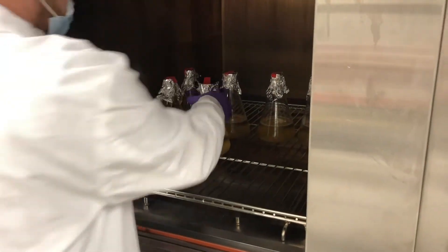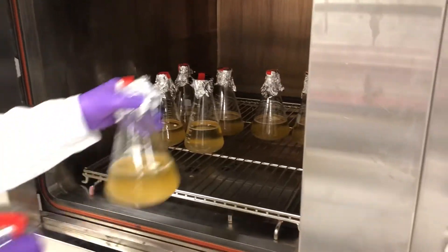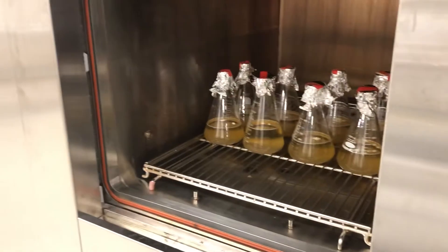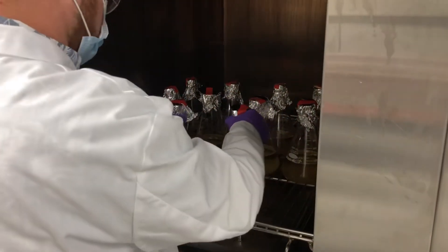Of course, when we take these out and they're hot, we'll be using one hand per flask. We're focusing on positional awareness so we don't drop the flask or knock into something.